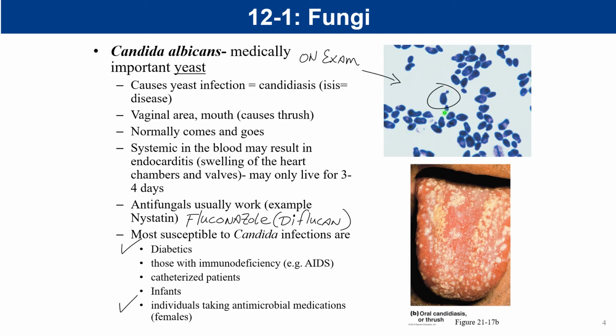Here you can see a picture. It says here on the exam. This would be if you were taking the lab exam, so keep in mind if you have a lab exam, a slide similar to this will show the mother cell and then a budding daughter cell reproducing asymmetrically. And this is one of the hallmark recognizable ways that you can see that those are not bacteria, but in fact that they are yeasts under the microscope.